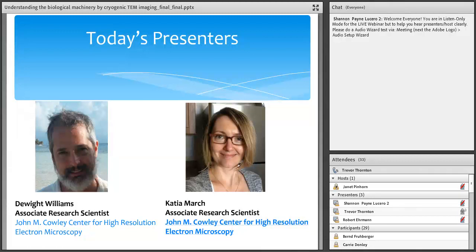It is. It's been a long time coming. A lot of technological advances in the last decade have really propelled us to that position. We came from a world where a lot of people discounted us as blobologists, and we're now moving towards more structural information at atomic resolution that is more accepted within the community. Yeah, and it's a pleasure to be there with you and my colleague to help ask some questions and discover what cryo-TEM is.